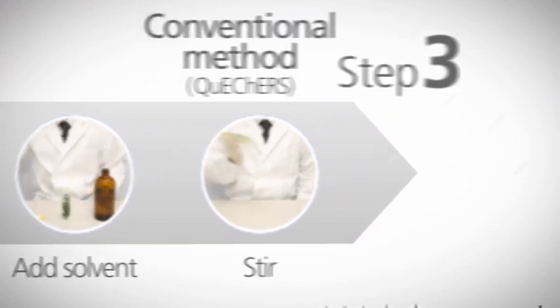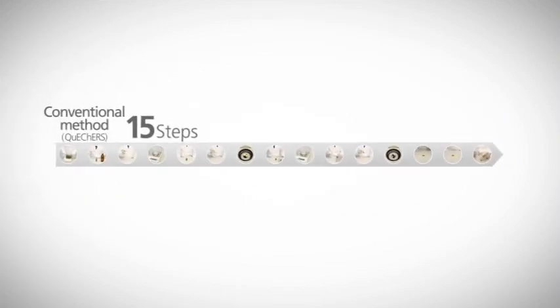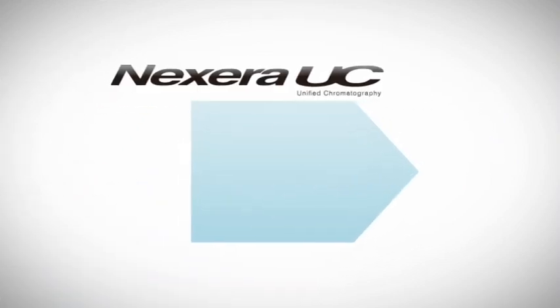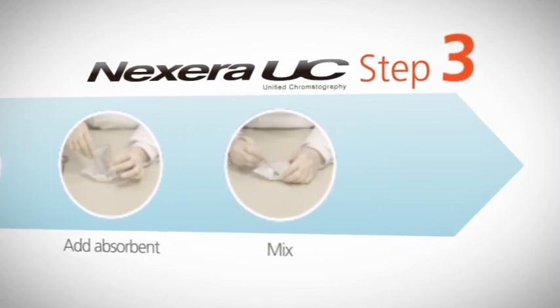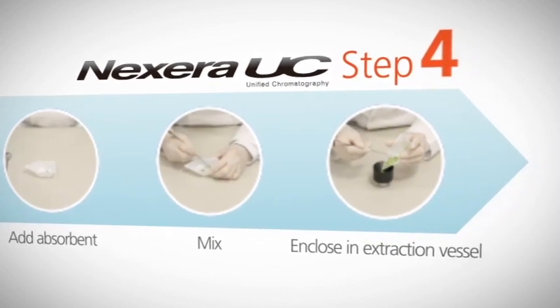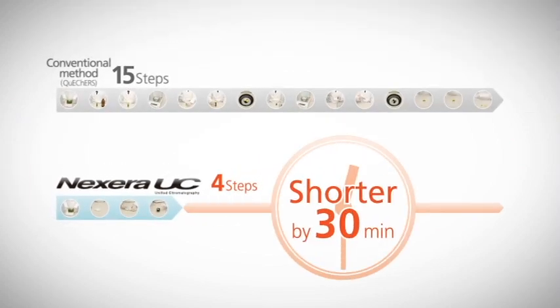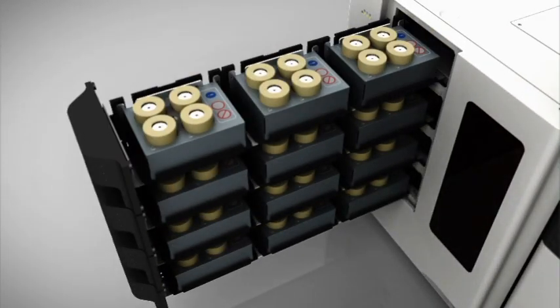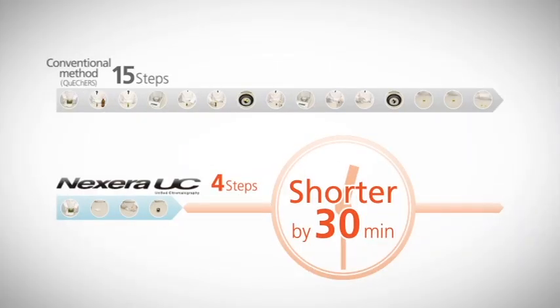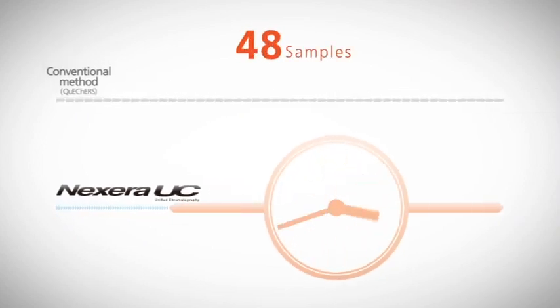Repeated addition of reagents, mixing, and centrifugation are needed prior to analysis. Nexera Uc eliminates many of these cumbersome steps, allowing sample preparation to be completed in just four steps for a single analysis. This can reduce preparation time by up to 30 minutes. In a high throughput environment, this time savings can be multiplied over the full 48-sample capacity of Nexera Uc — up to 24 hours of analysis time can be saved versus standard sample preparation.